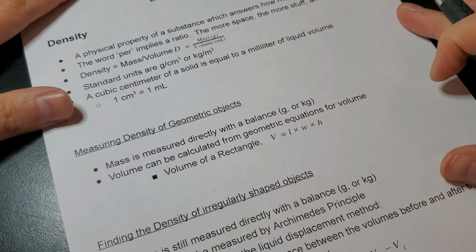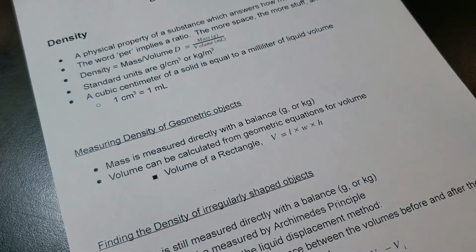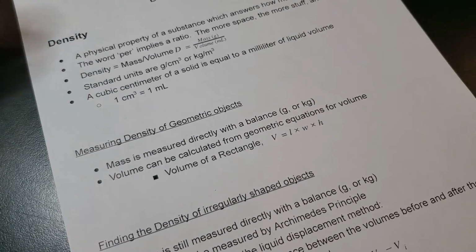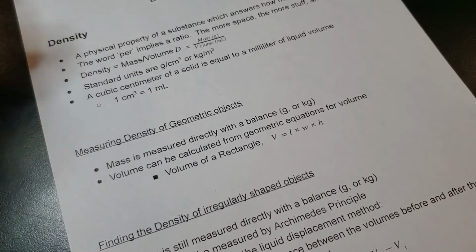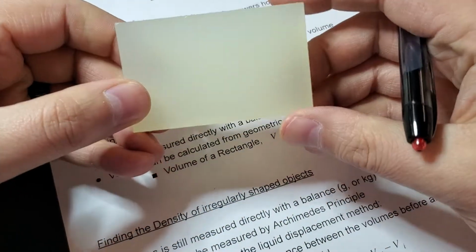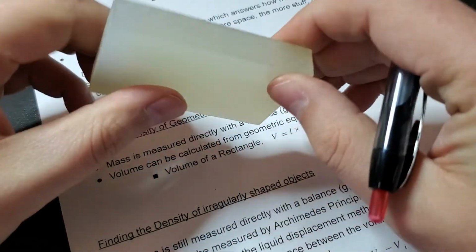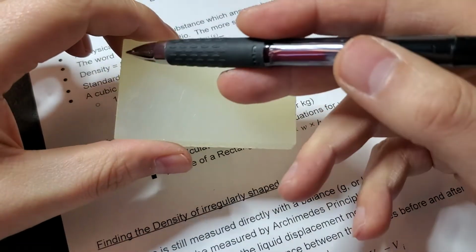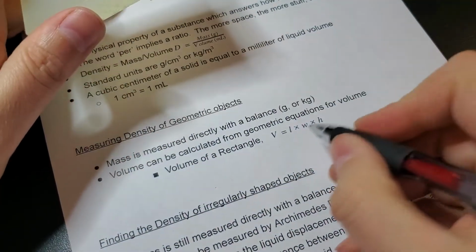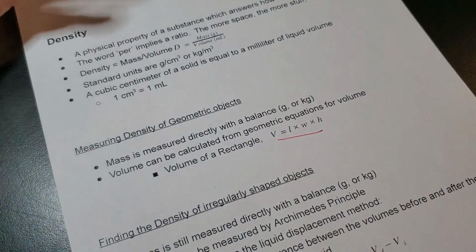So the easy one, the one that we're going to do first, the one that involves these blocks right here, is a calculation of, we can put the mass on a balance, get that, and density being mass per volume, mass divided by volume, we need the volume of this. And any sort of a nice geometric shape like this works out well, because we can take the 3 dimensions of it, the length, width, and height, multiply those all together, and we end up with the volume. So that's the pretty straightforward one.